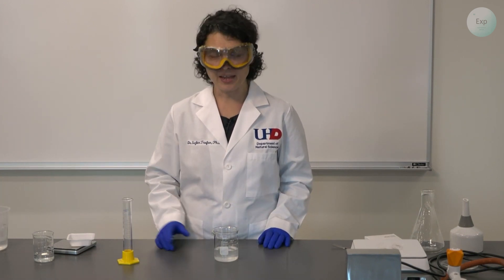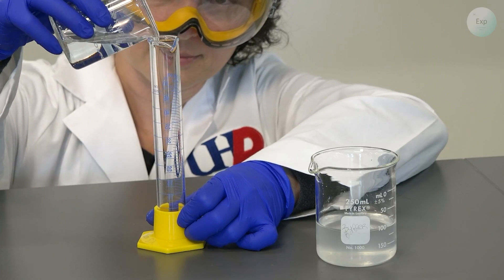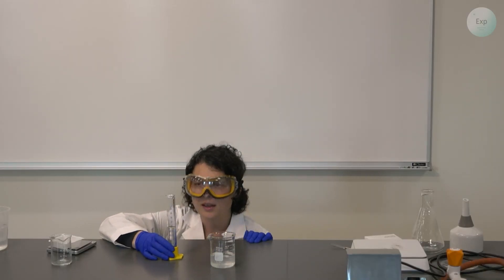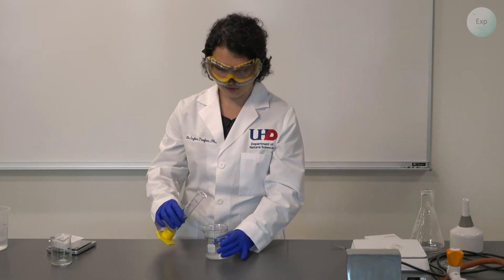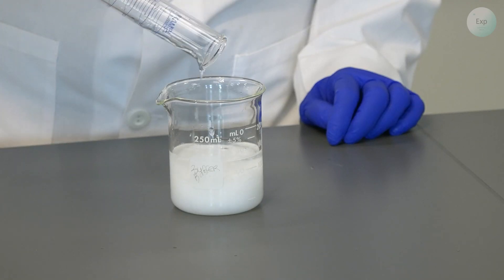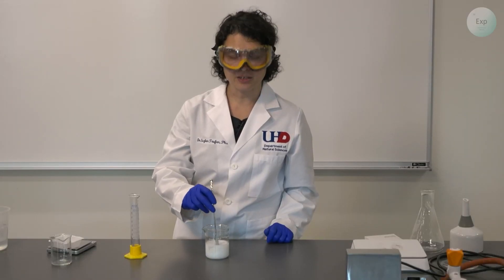The next step is the precipitation. I am going to use my calcium chloride solution and add 30 milliliters of the saturated sodium carbonate solution — you can always use a little more. Today I am using 31.0 milliliters of the saturated sodium carbonate solution. Slowly we start the addition; we can use a spatula to stir it, and we can feel a very thick precipitate forming.